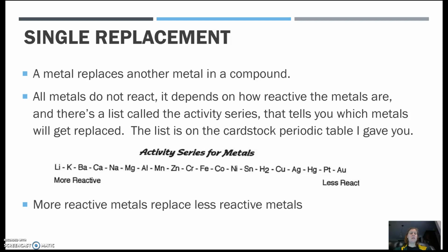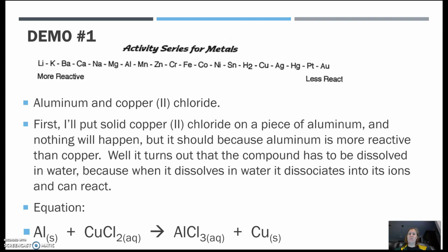Single replacement: I'm doing this because I do want you to know you can predict products. It's really cool, you can predict whether a reaction is going to happen. I'm going to do 2 demos, one where it works and one where it doesn't, because, again, I have those chemicals. I'll show you the one that works, and then I'll flip through really fast to the one that doesn't.